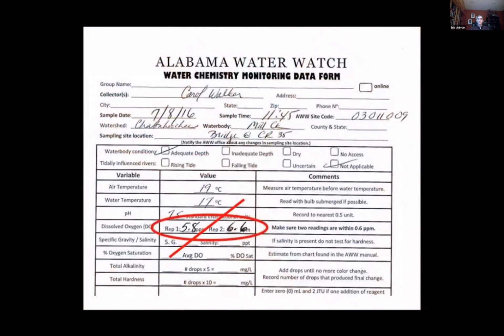If the two DO results are not within 0.6 parts per million of each other, rinse and refill the titration tube with leftover fixed sample from the first sample bottle and follow the titration steps. If the results still vary by more than 0.6 parts per million, repeat the entire procedure with new samples of water from the site. Leftover sodium thiosulfate in the titrator could have been contaminated with the water sample and should be discarded. Do not return the leftover titrant to the bottle.